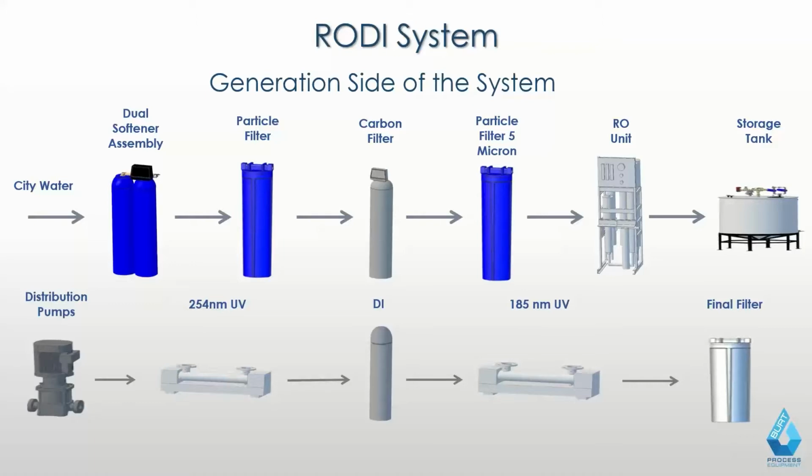Your water quality in a lot of ways determines what this overall PFD is showing. This is obviously a very simplistic representation. When we get to the actual system we're talking about today, I'll show you a little more about how that comes together. But depending on whether you're ASTM 1 or ASTM 2 water, or CAP 1, how many UVs, your DI, the DI location, use of EDI, nitrogen blanketing, all kinds of different things come into play as part of that overall system design.